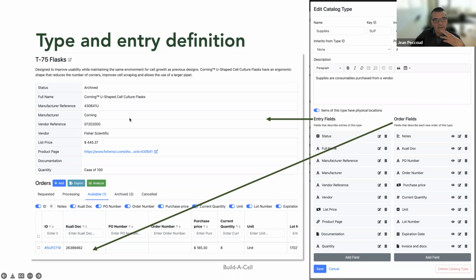Experiment being defined in a very broad way, like placing an order for a supply could be seen as an experiment at some level. But it can be applied to a cell culture, it can be applied to a DNA extraction or a sequencing operation and things like this. So these are the things that you're going to be controlling. And the data that you're associating with the physical instances are data that you don't control, that you observe. And the different instances are essentially replicates.